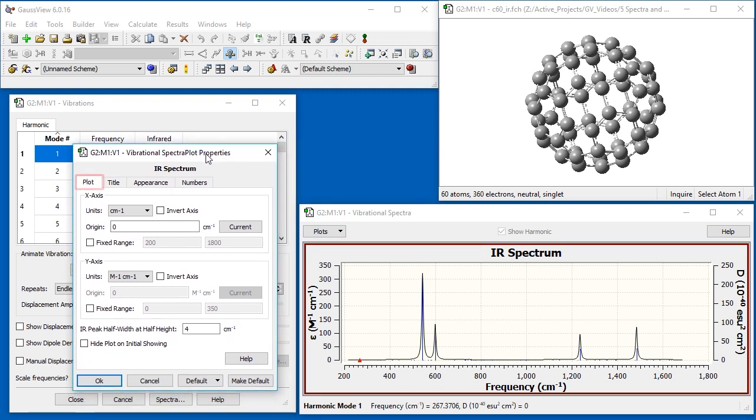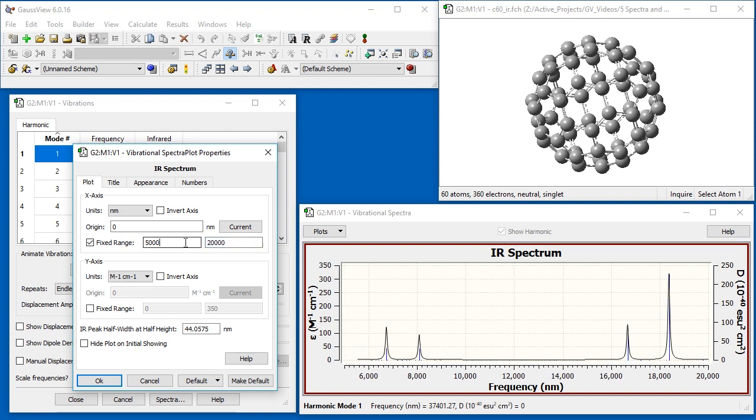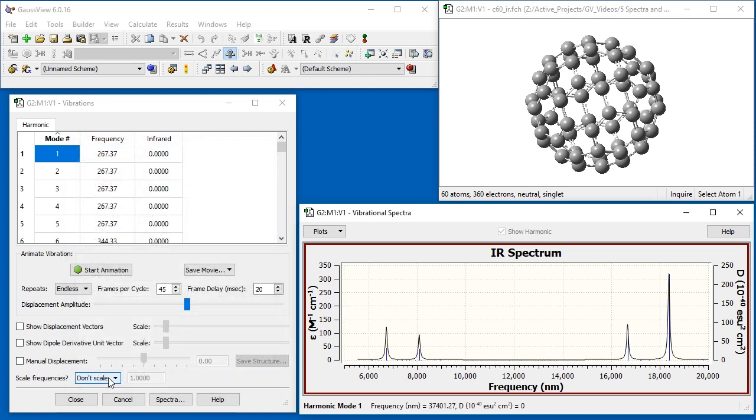The Plot tab allows you to customize many aspects of the X and Y axes. We will select nanometers as the unit for the x-axis. We also want to limit the range of the x-axis to the range containing data, so we check Fixed Range and change the upper limit to 20,000. Once we close the dialog, the spectrum display updates following our specifications.